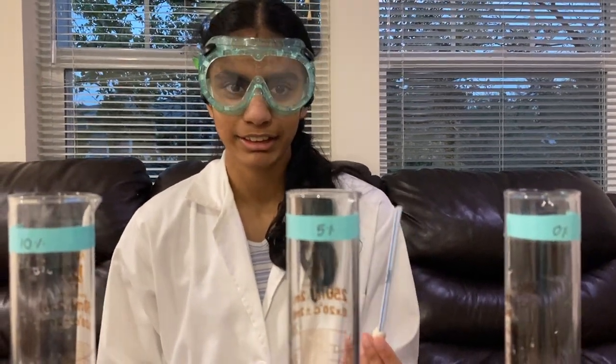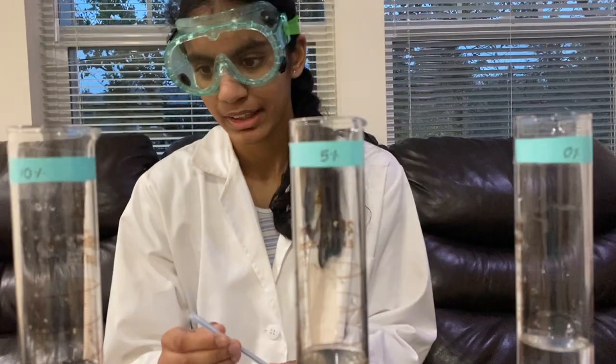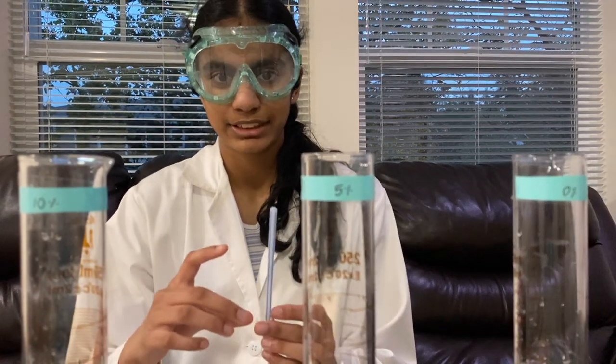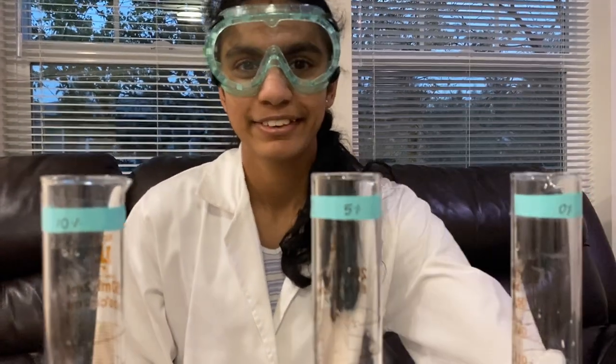This is because 10% salt solution has a higher density than 0% salt solution, which causes the salinometer to float higher. So to recap, today we tested my solutions by using the salinometer I constructed out of a straw, a ball of non-water-soluble clay, and my markings. I showed you my calibration curve and how the length of the salinometer submerged under water is correlated with the salinity of a solution. I also showed you my diagram. Thank you for listening.